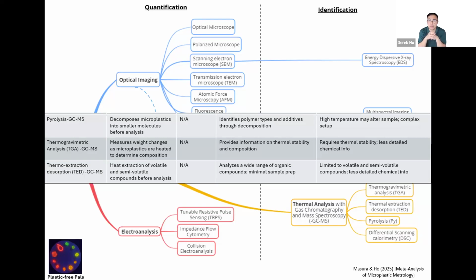However, this method is a bit finicky because it doesn't allow us to analyze a lot of particles at the same time due to potentially interfering thermal variations. Also, the additives inside all of the plastics may convolute the spectra, causing it to require a comparative ground truth in order to validate whether those particles are what we said they are.